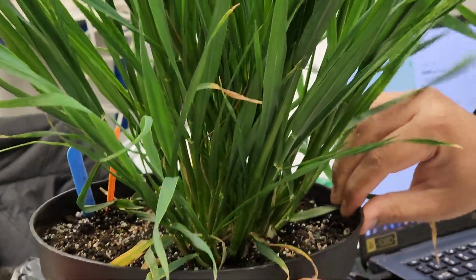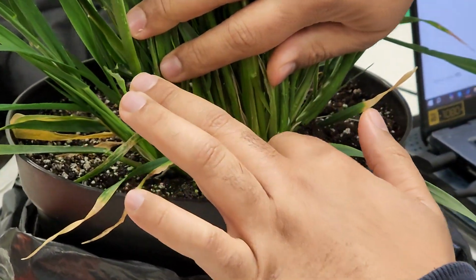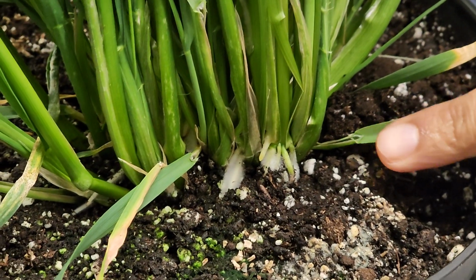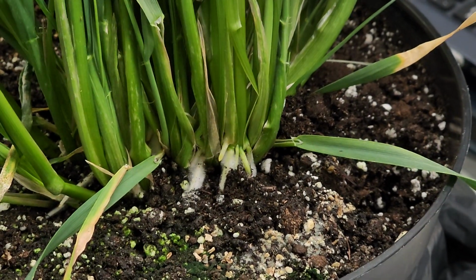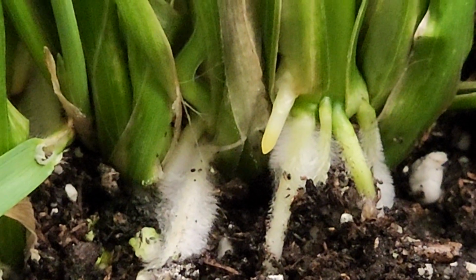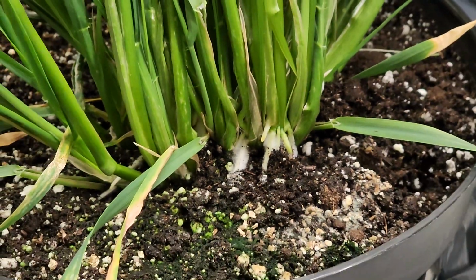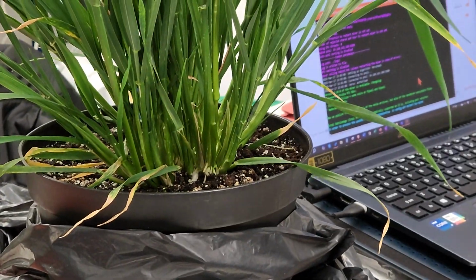So apparently after you move to the regular growth chamber, it has this adventitious root coming out. Can you see the root? Yeah. So hairy. I think if you zoom in, you can see how hairy the adventitious roots are. Got all the micro root hairs.